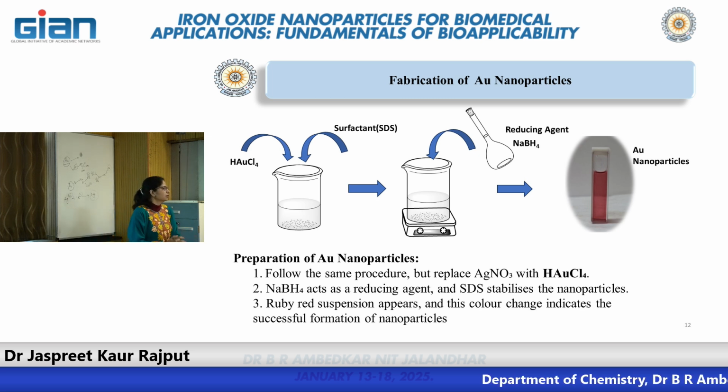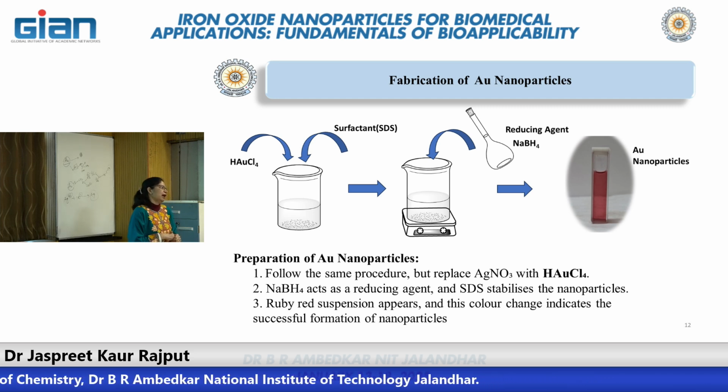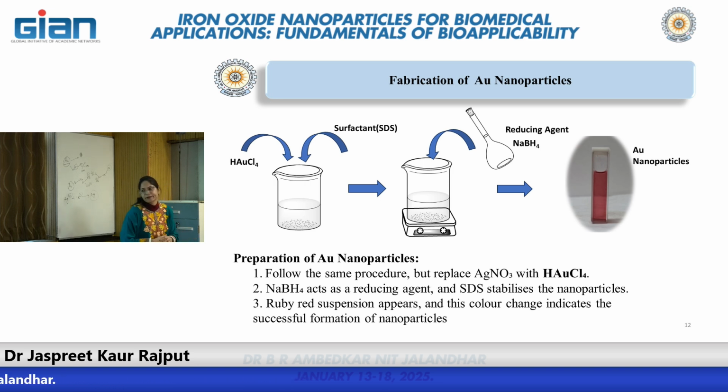So you can use other surfactants also, but this is a basic technique for the synthesis that we are telling you. Further, you can look into the literature and explore the reaction, and you can apply your own ideas and modify it.